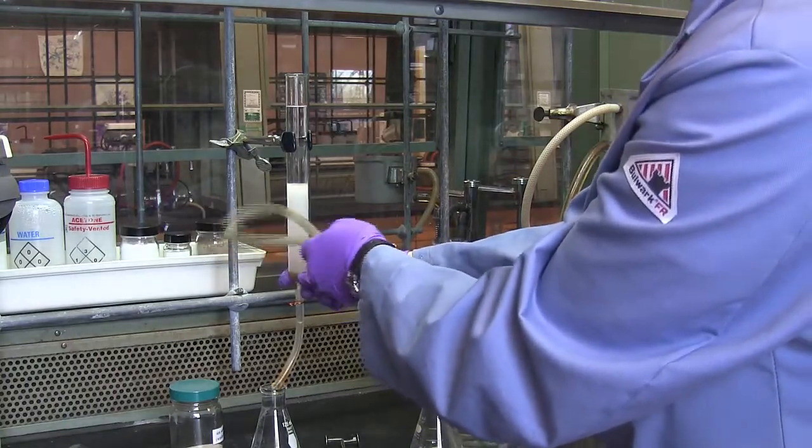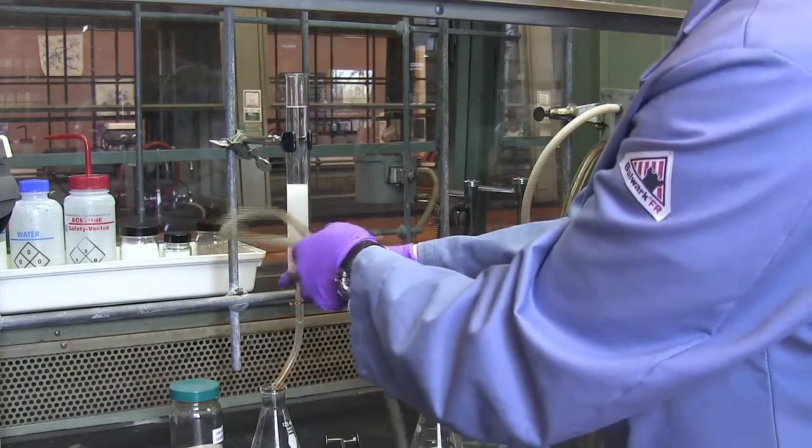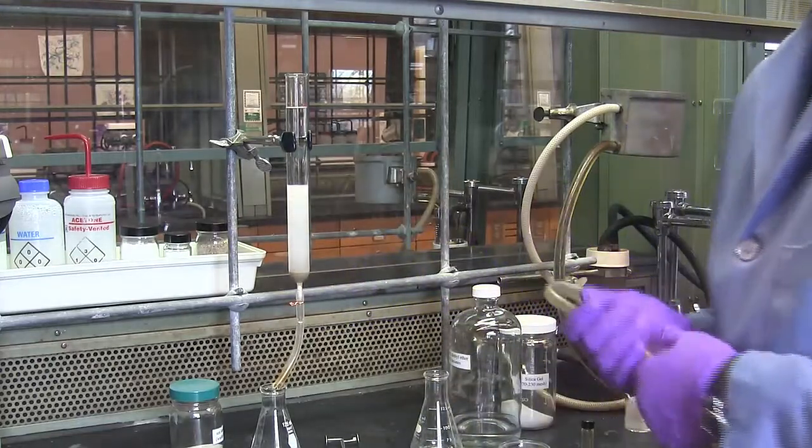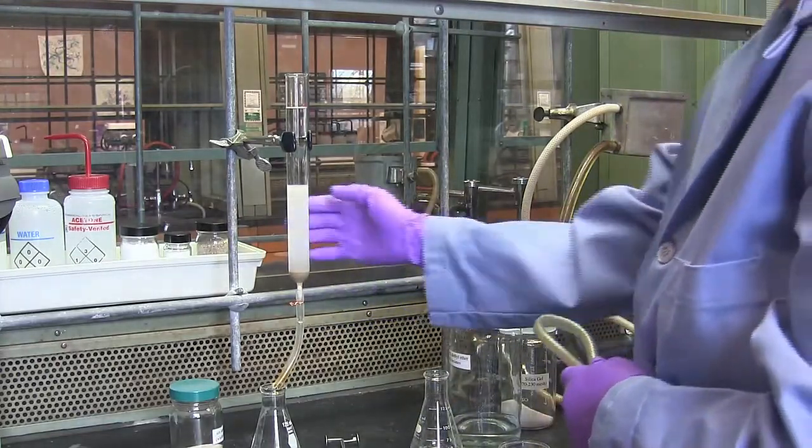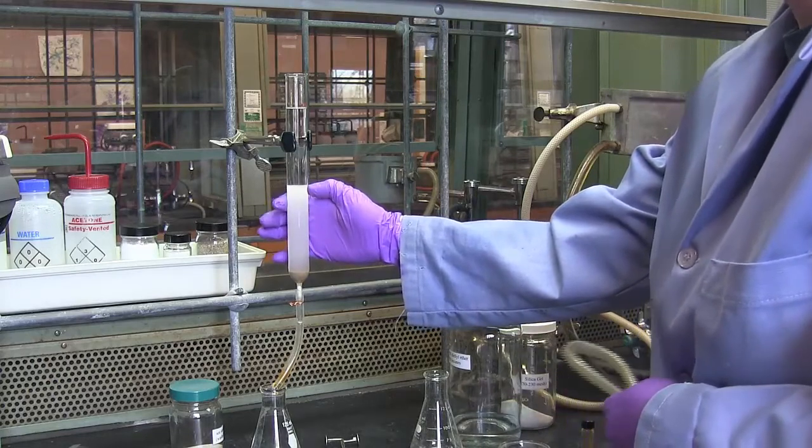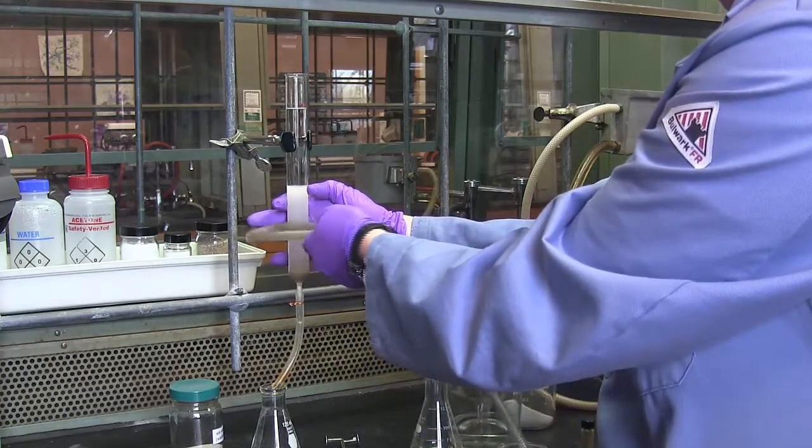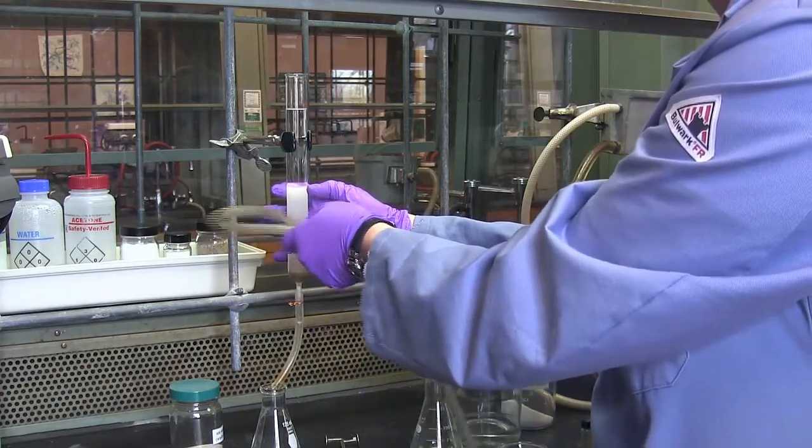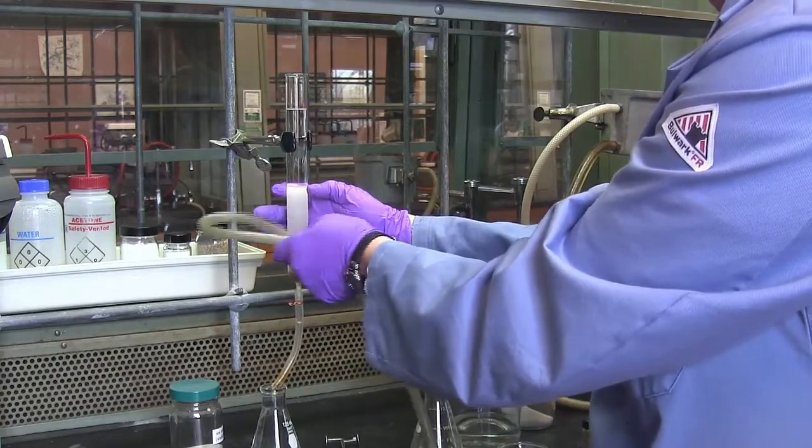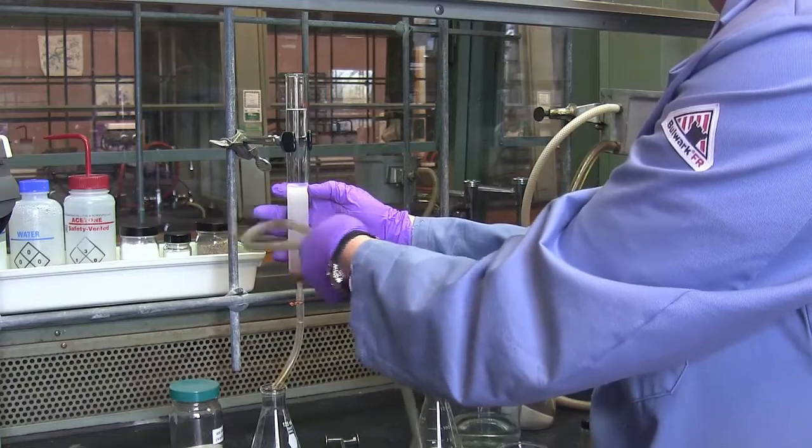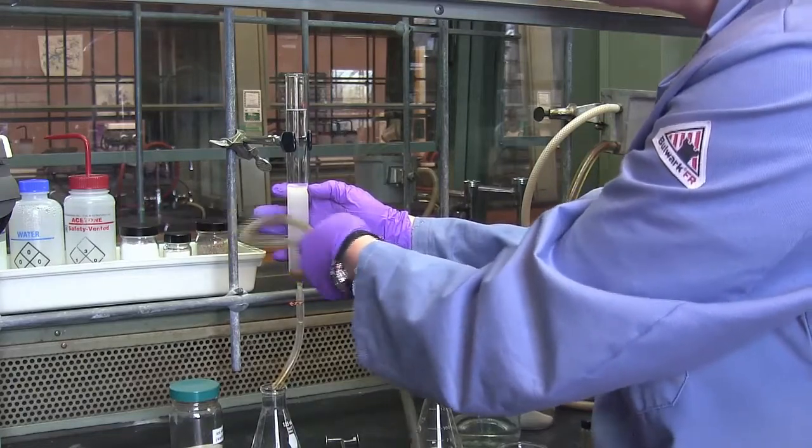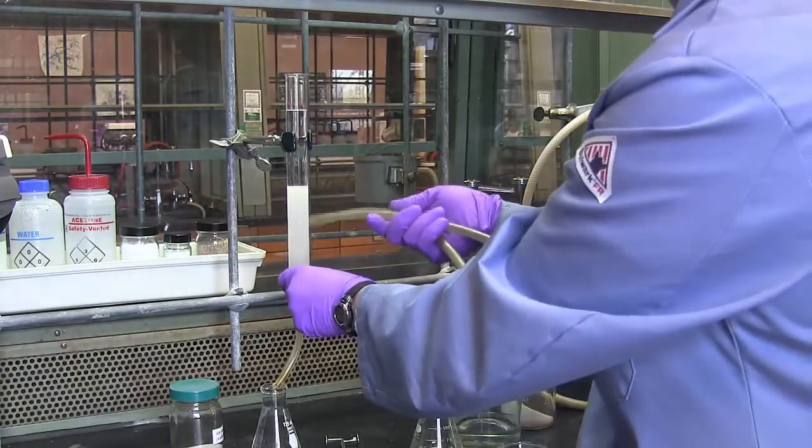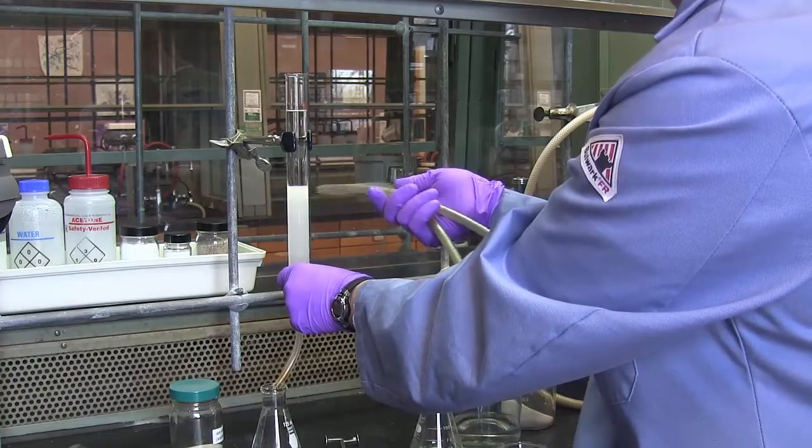It usually takes a few minutes of tapping for the silica gel to settle completely. Usually if I want to test whether or not the silica gel has settled, I'll use a finger to mark the top of the silica height. I'll tap for a few minutes, being careful not to move my finger, and then check to see if the silica gel has dropped. Usually takes a couple of minutes of tapping for the silica to settle.